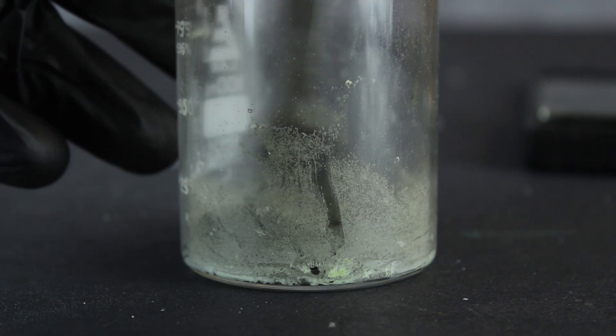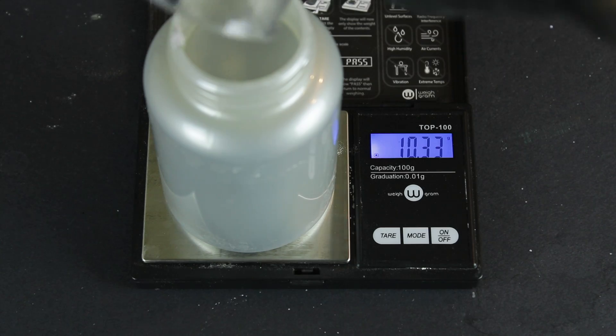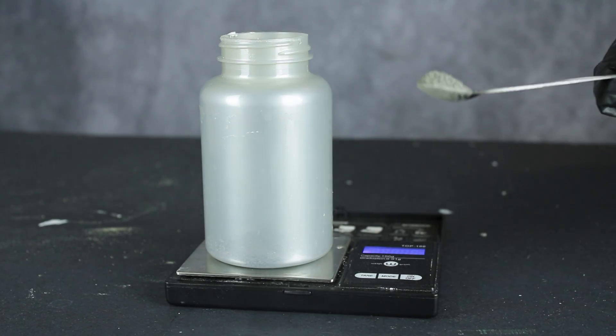Then I used a metal spatula to break up the solid mass, which I crushed up into a powder and weighed. In total, I obtained 10.45 grams of phosphorus pentasulfide. I tried burning some off camera to ensure it wasn't just sulfur, and the bright green flame and white smoke definitely told me there was phosphorus present.